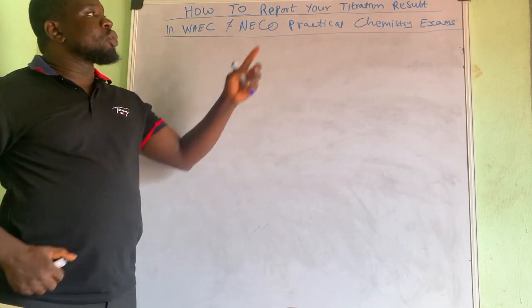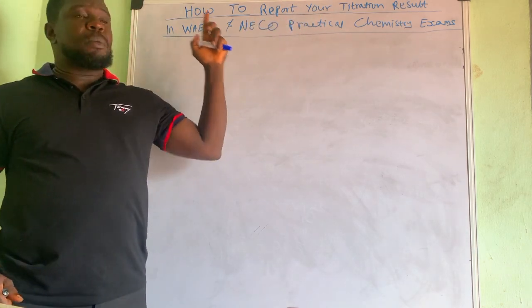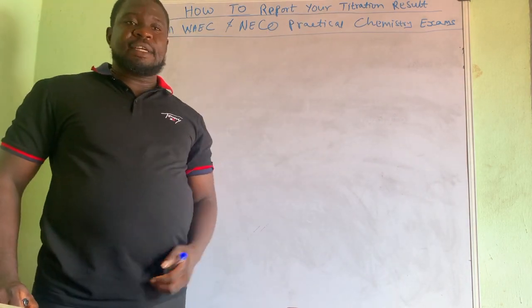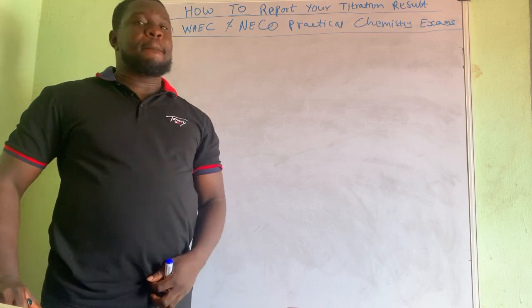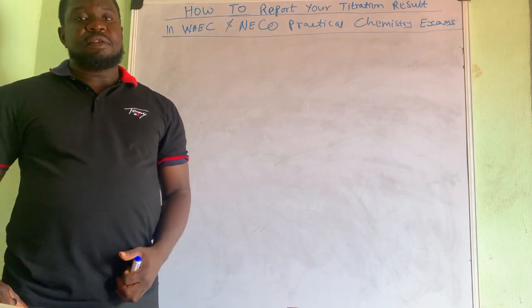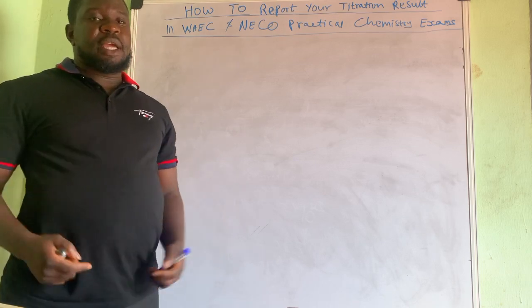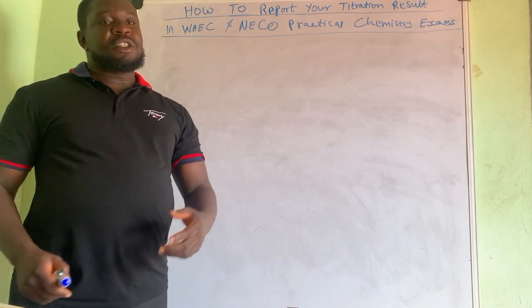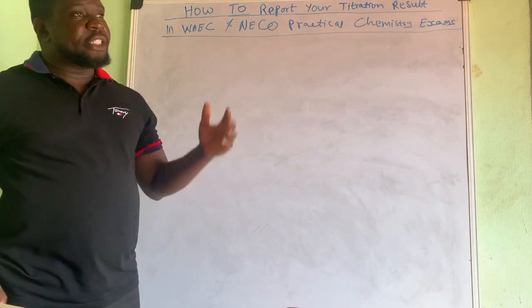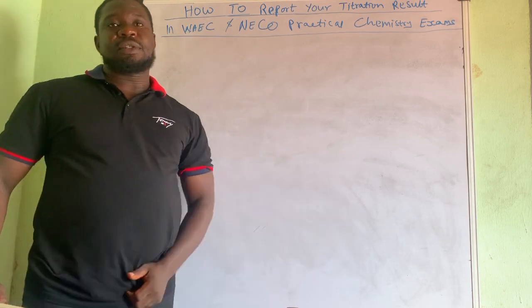In this class, we are going to be talking about how to report your titration results in WAEC and NECO practical chemistry exams. WAEC exams is around the corner, and all of us are preparing for it. Many candidates are already rounding up their preparation. At this point, it is important that you learn how to properly report your titration results during these exams.